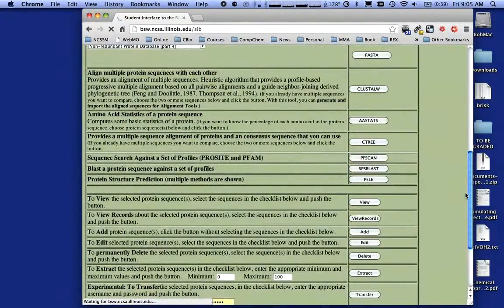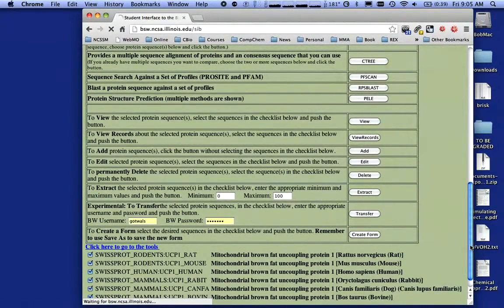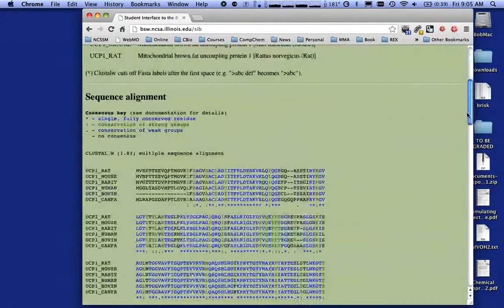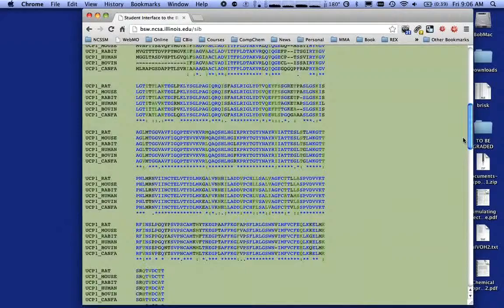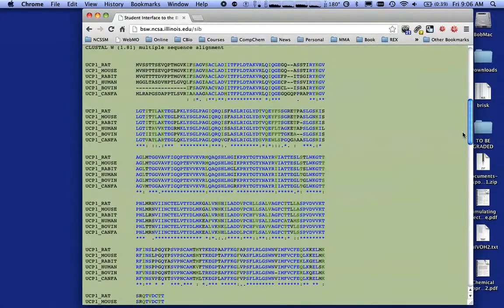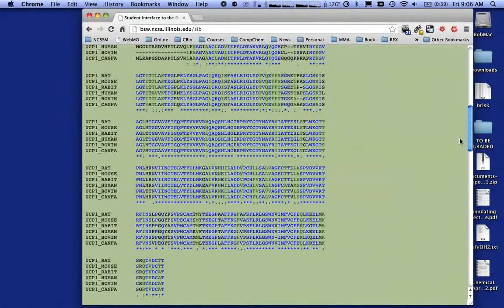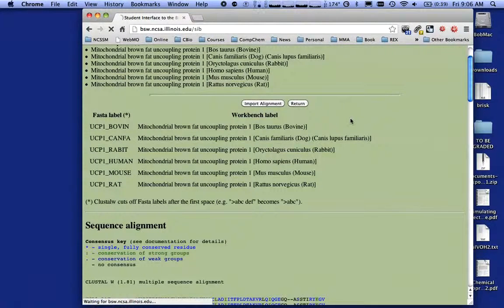I can use the protein structure prediction tools or Pele to predict how this protein might fold. But keep in mind that if you want to do something to a protein or multiple proteins, you've got to click on the checkbox first — otherwise nothing will happen. I encourage you to play with all these tools. Here we've got our complete alignment. You can look at this and try to figure out how these organisms all compare — there looks to be a lot of consensus. I'm going to import the alignment.